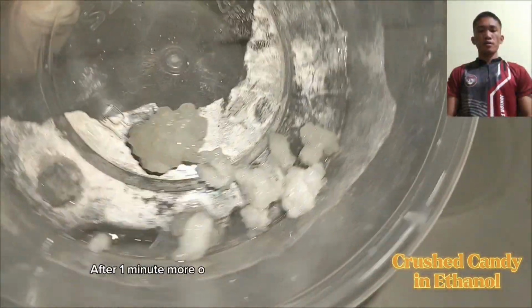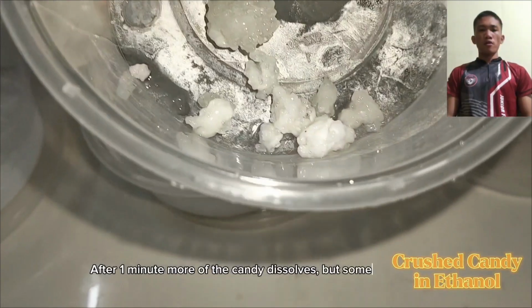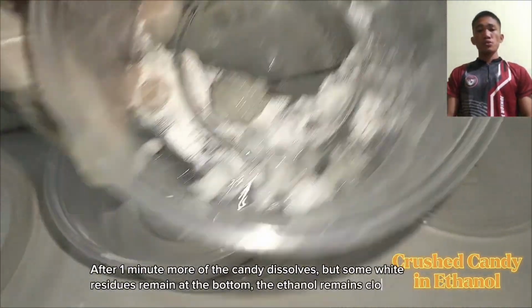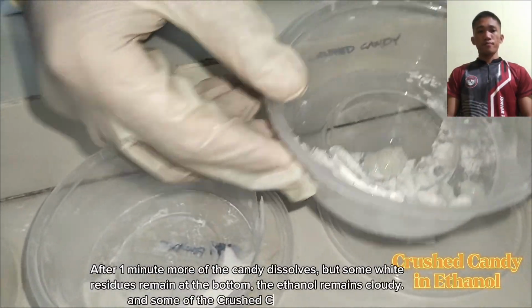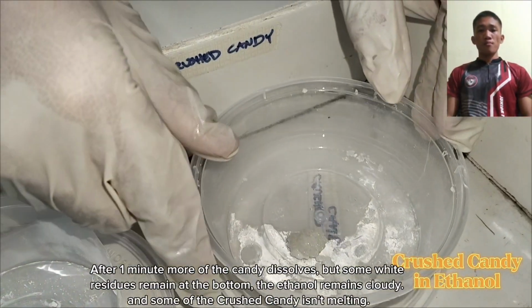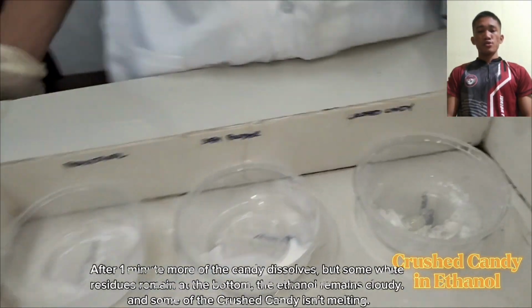After 1 minute, more of the candy dissolves, but some white residues remain at the bottom. The ethanol remains cloudy. Some of the crushed candy isn't dissolving.